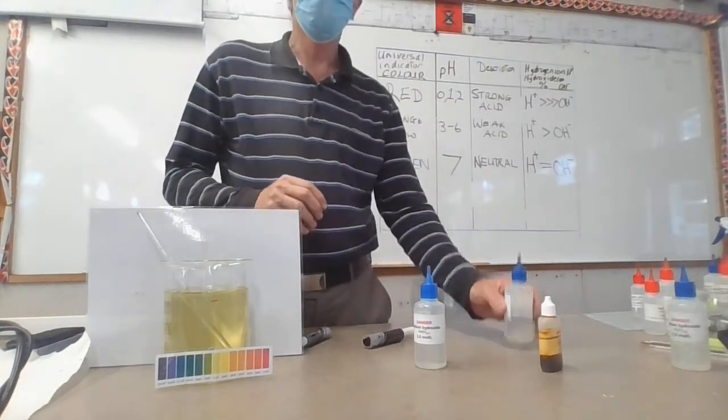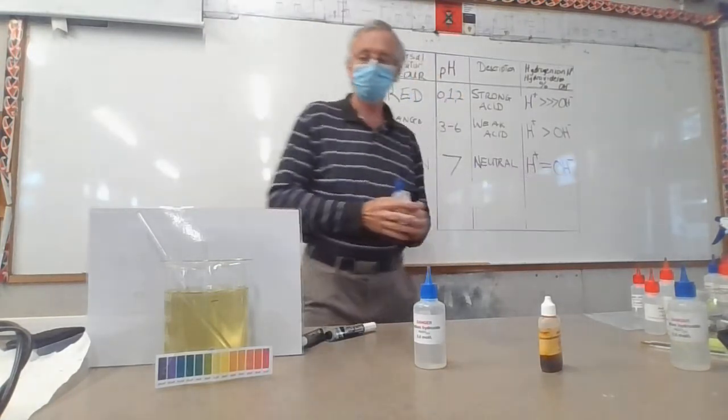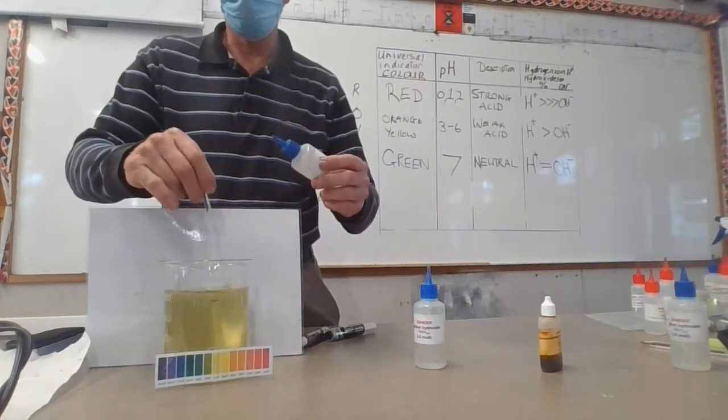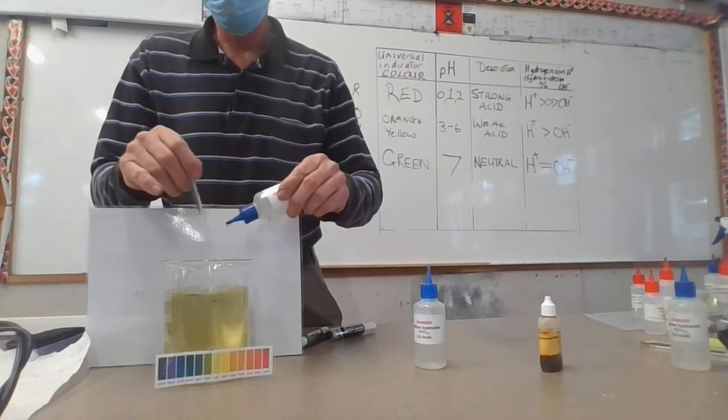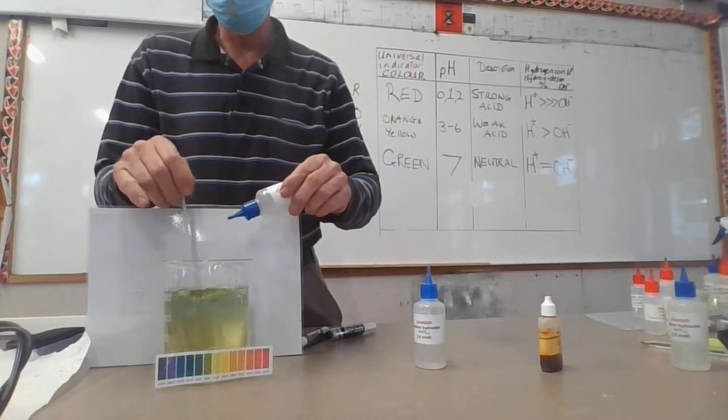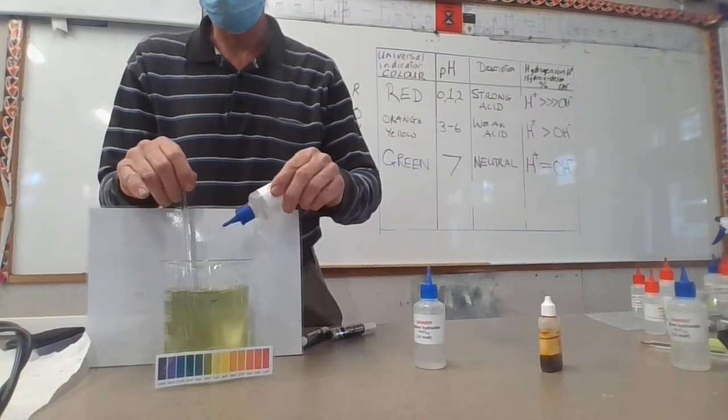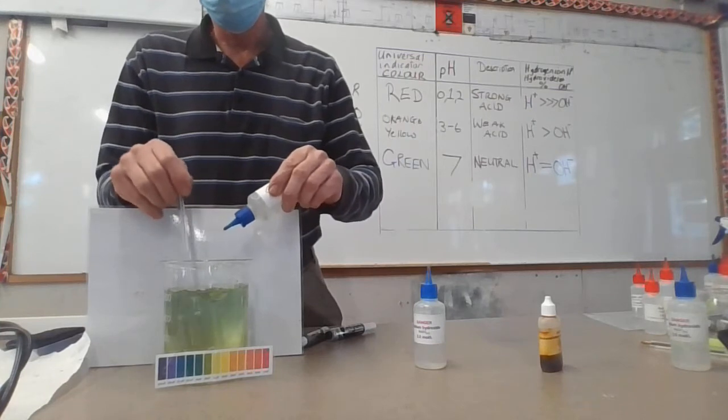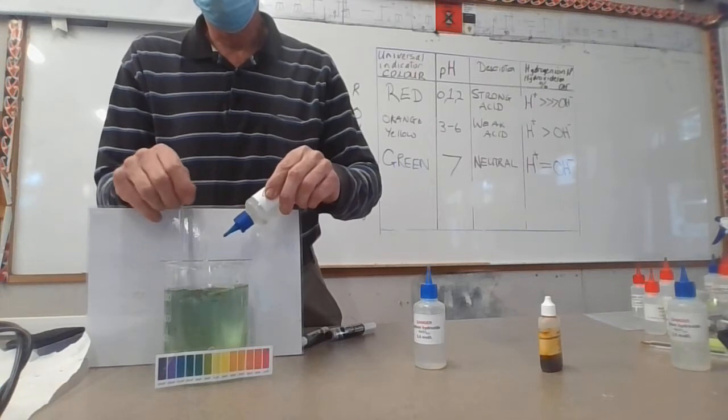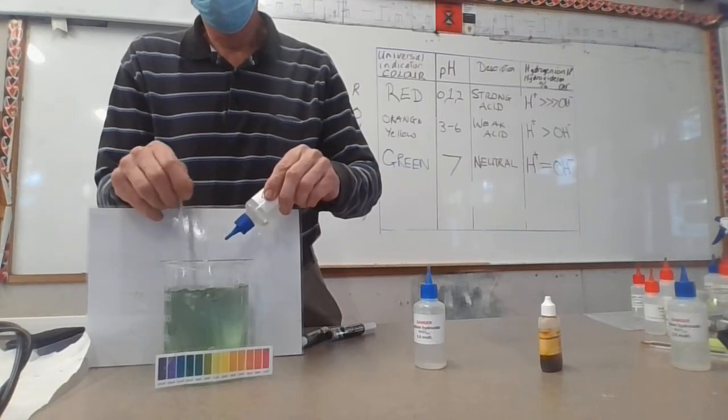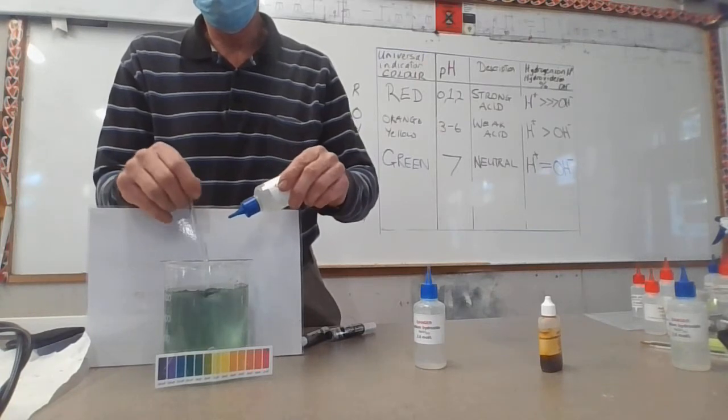As you can imagine, if I add more base, we are going to end up with more hydroxide than hydrogen ion and our solution will be basic. I see it's snuck back to yellow. I'm going to add ammonia to try and get to the blue color. There's our green again, our neutral. Sometimes it takes a little while for these things to react, which is why the color snuck back. We should be moving from the green, getting a bit blue. There we are, basically now we have a blue color.